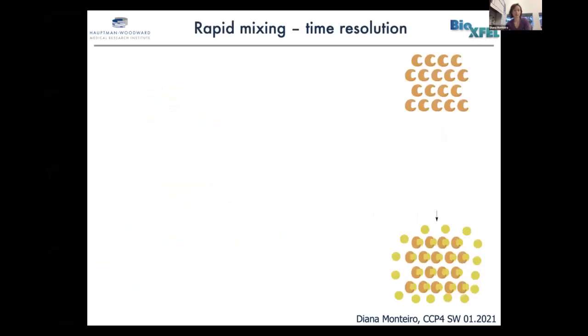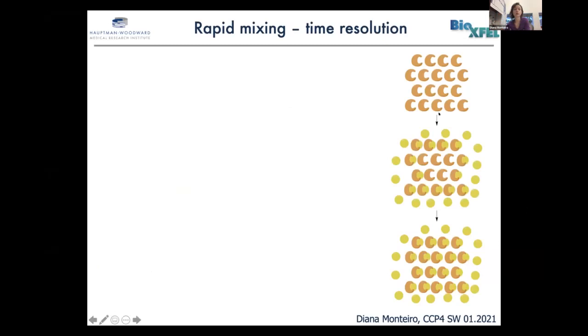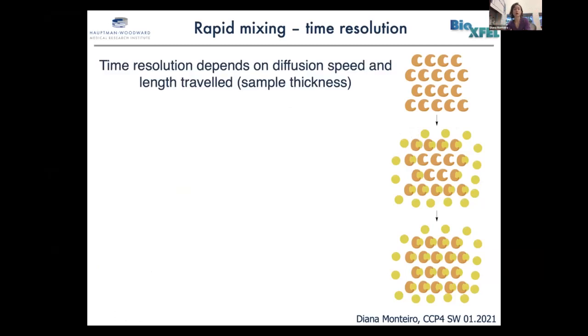So let's talk about time resolution. So this is the scheme that I had before, which is basically you have your ensemble, you add something and you trigger your reaction. And a lot of people look at this as it being almost instantaneous. And in reality, what you're doing is you're diffusing something into your ensemble of molecules. So you will start the reaction from the outside in, and you will have a time resolution issue.